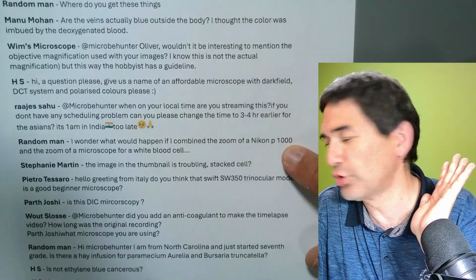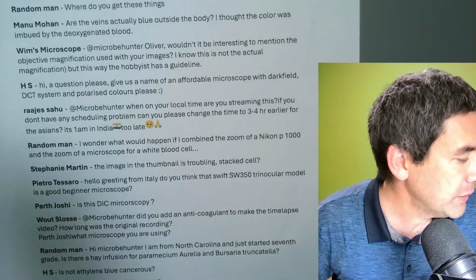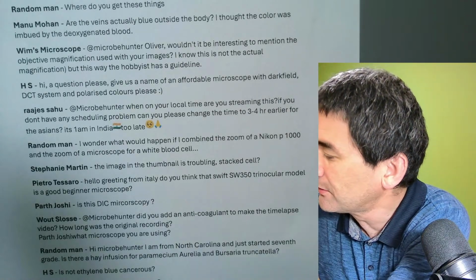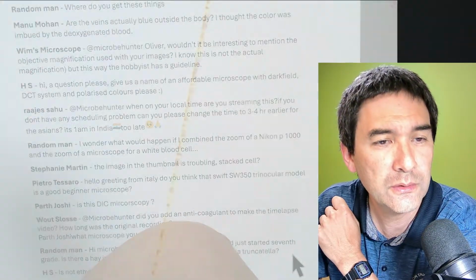you know what? I'm going to just show you something. Okay? The whole issue about zooming. I'm just going to use the frog one again, just because it's easy to see the nucleus. And I just want to show you now. Scope view.